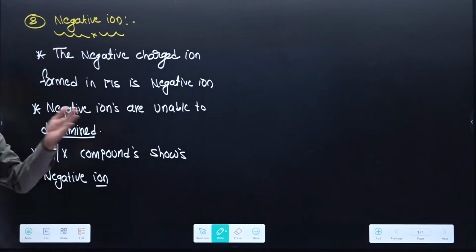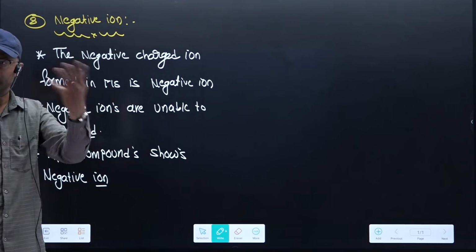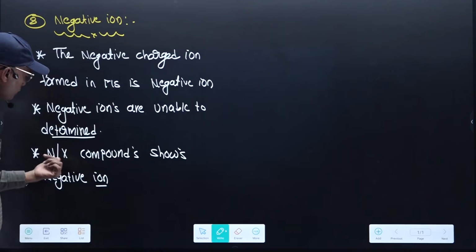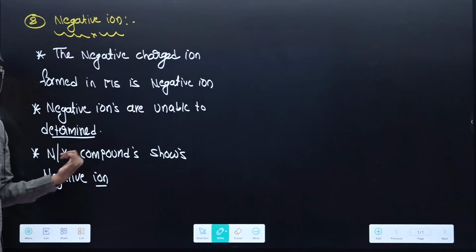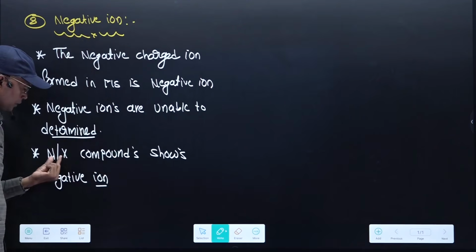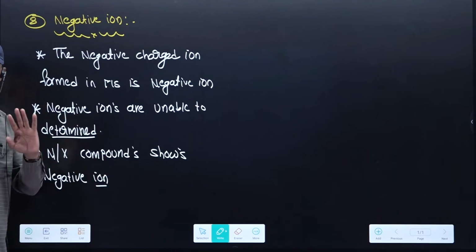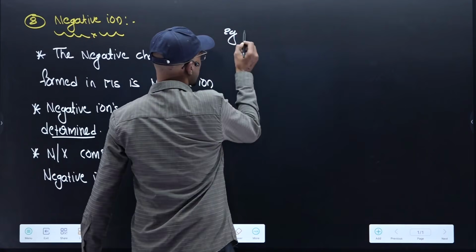Here ejection will not take place. Absorption will take place. Absorption is nothing but, when the beam of electrons is coming towards nitrogen, that nitrogen will take an electron. It will suck one electron. But normally what happens? Nitrogen can lose one electron during electron impact. Halogen may lose one electron during electron impact. That does not take place in negative mass spectrometry. In negative mass spectrometry, nitrogen and halogen compounds will suck one electron. That is taking in one electron. So always it will give a negative charge which will appear like this.